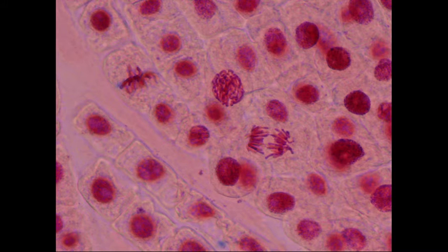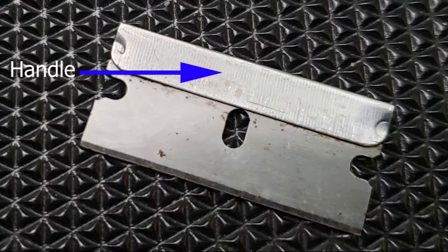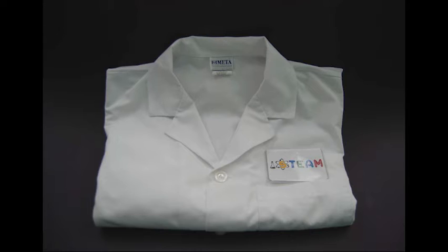Making your own slide. In this activity, you will learn how to make your own microscope slide. Safety: carefully handle the razor blade by using the top as the handle. The blade at the bottom is extremely sharp. Wear gloves and protect your clothing when you handle acetoorcine stain.